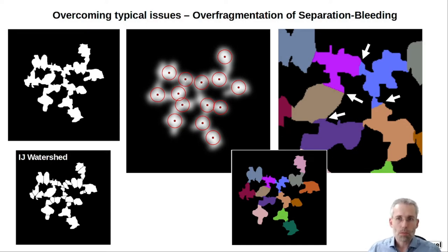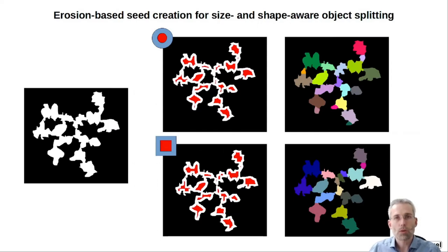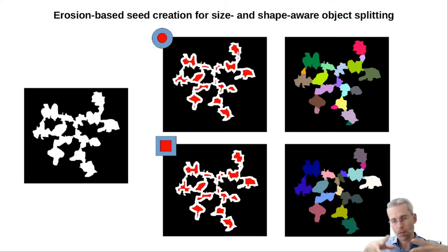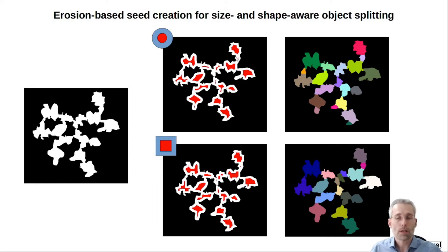Therefore in this toolbox there are two erosion-based methods included. The extracted objects, whether 2D or 3D, are actually eroded in either a sphere or a box environment, creating seed objects displayed here in red. Due to the nature of the erosion these seeds still have some information about the original shape and size of the object, and from those seeds the Voronoi separation is then performed. In most cases this works quite well, especially for bigger objects, but dependent on the erosion amount we might create some small fragments, which may lead to some unwanted separations.